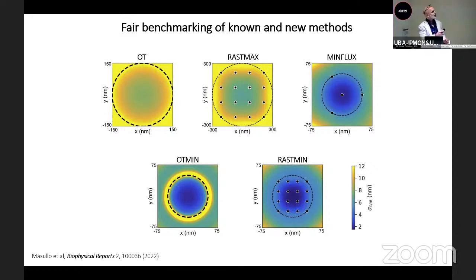Okay. If you want to do raster scanning, you need to scan an even larger area. You need basically to scan not the width of your beam, but a complete PSF to really pinpoint the position properly, like we did with the camera. So that's why here it is about 2 times the size of the orbital tracking area. Okay, but it works. But the key point is all methods using a minimum give you this opportunity of zooming in.